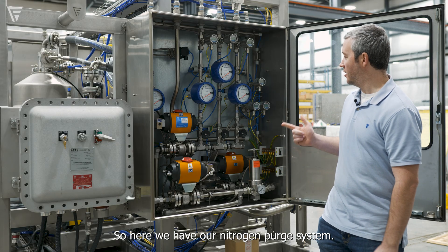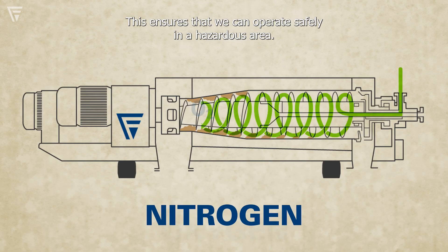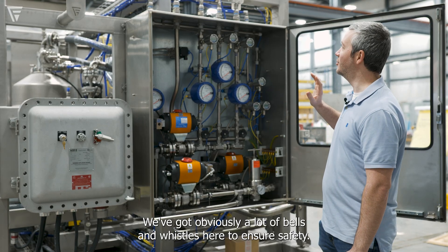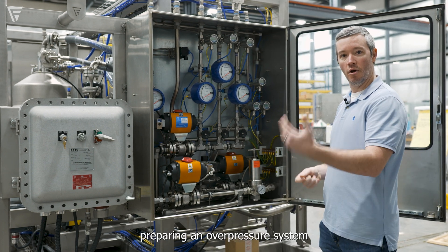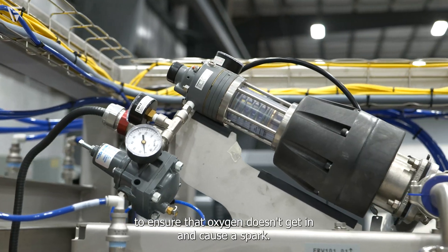Here we have our nitrogen purge system. This ensures that we can operate safely in a hazardous area. We've got a lot of bells and whistles here to ensure safety. We run through different points of the machine, maintaining an overpressure system to ensure that oxygen doesn't get in and cause a spark.